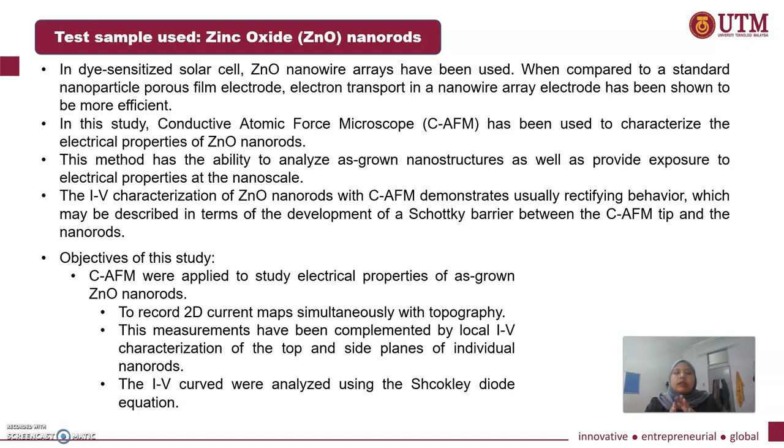This method has the ability to analyze as-grown nanostructure as well as provide exposure to electrical properties at the nanoscale.